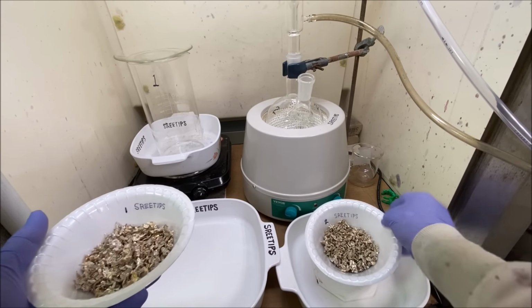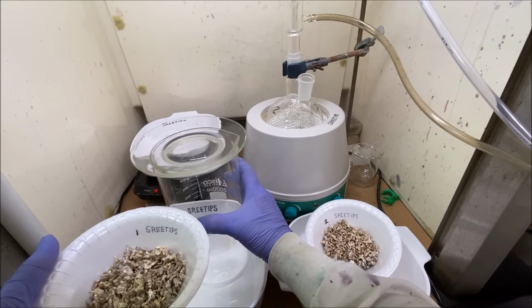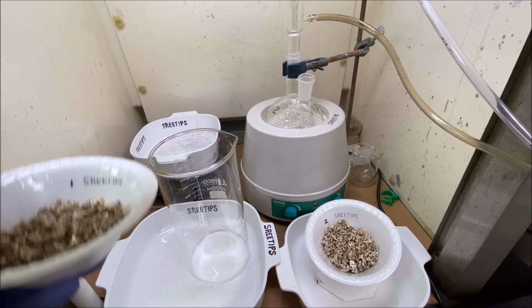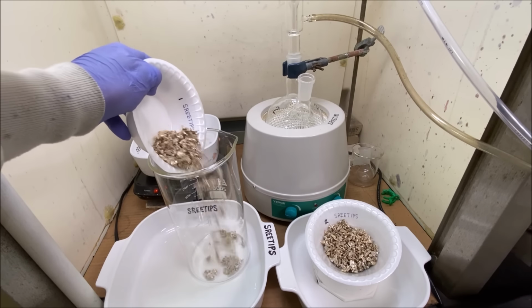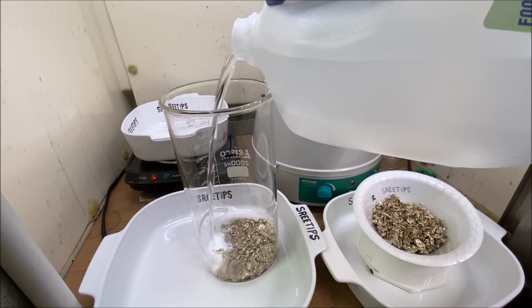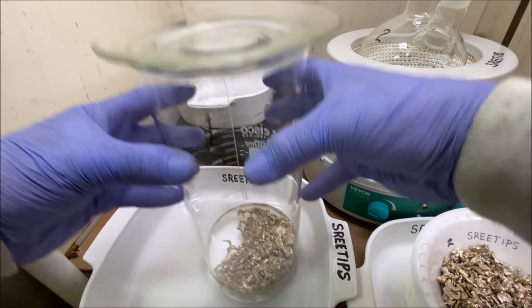And what we'll do is add this to a beaker over here. Dump it right on in. I'm gonna start out by adding about 100 milliliters of water. We'll set this up on our burner.